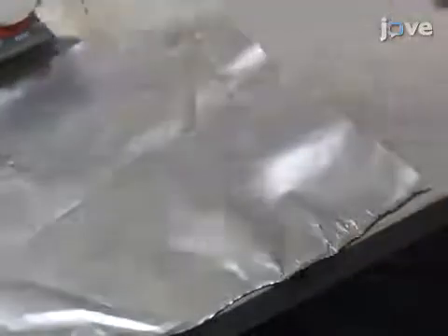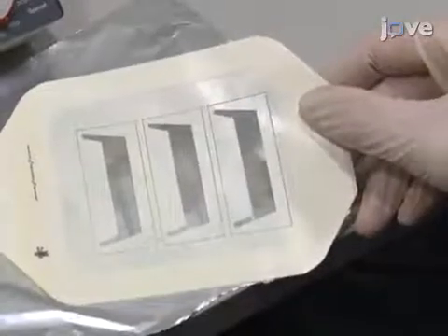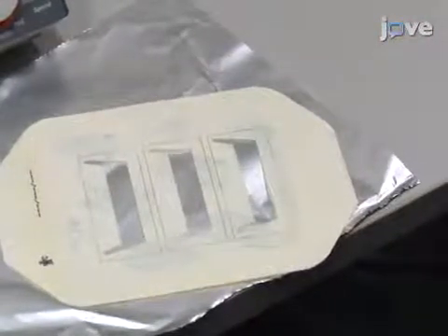Prior to assembling the flow chamber, cut a flow channel in a 40-micron thick transparent adhesive film. Spray quick-fixing adhesive on the non-adhesive side of the film and allow the adhesive to dry.